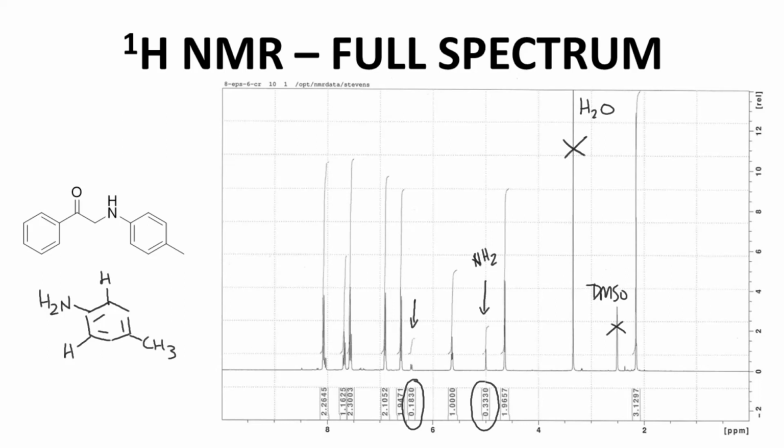Whether I identified the impurity correctly or not, I did recognize that the crude material does indeed contain an impurity. While I did not put it in the video on the reaction, I did do a recrystallization of the crude product from ethanol. Getting this material into solution was not trivial. That was the first thing that made me think something was amiss.